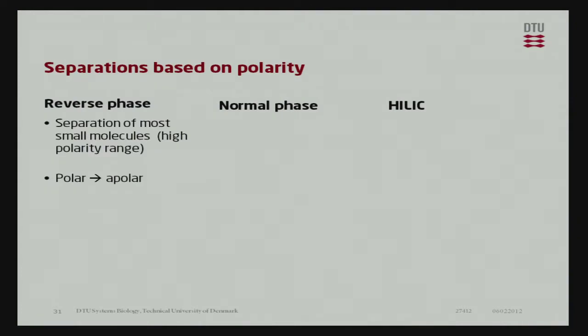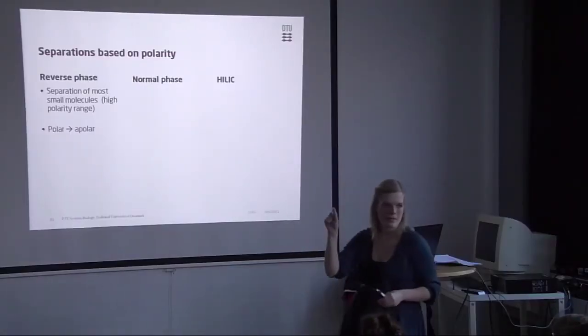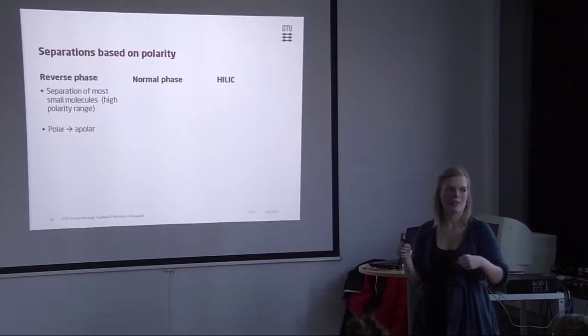The order of how molecules move through the column, moving through the street of bars: the polar ones will come out first, because the stationary phase that Christian showed here, C18, is very apolar. That will attract likes, so it will attract apolar compounds, while the polar ones will be more quickly pushed through. So we'll have the polar compounds coming out first, and then apolar coming out last.